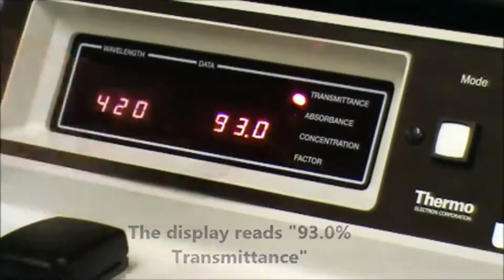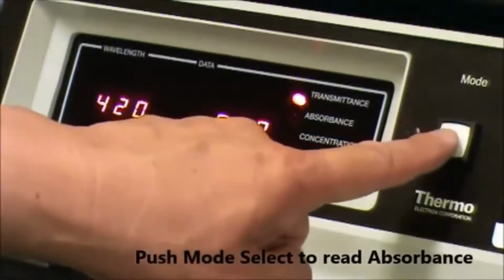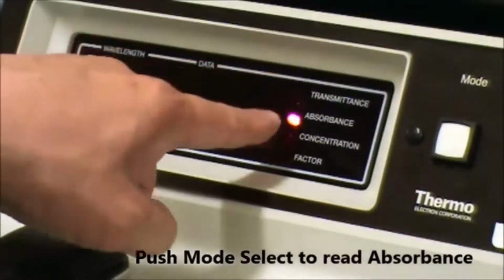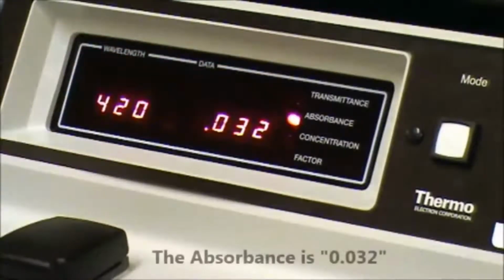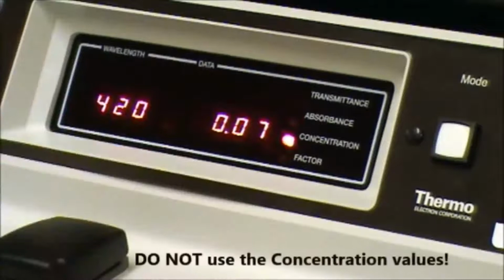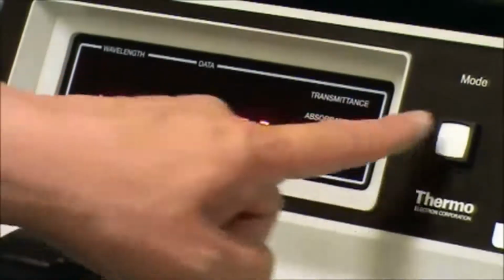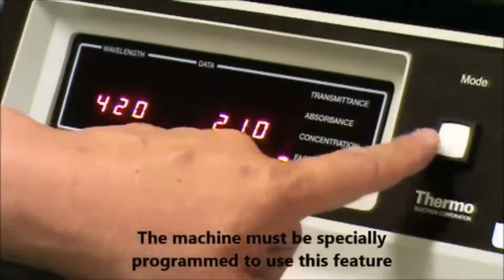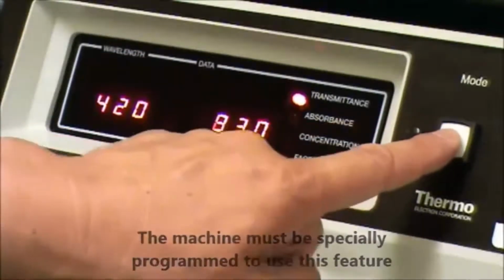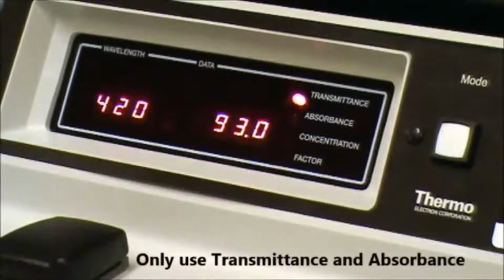You can also take an absorbance reading by simply pushing the mode button to go down to where it says absorbance. So when the absorbance LED is lit, you can see that at the same wavelength, the absorbance is 0.032. You want to ignore that. The machine has to be set up specifically in order to use that option, and this one is not. So do not write this concentration down, and you need to know the correct factor in order to set the concentration. So ignore those. Just use the transmittance and absorbance on the machine.